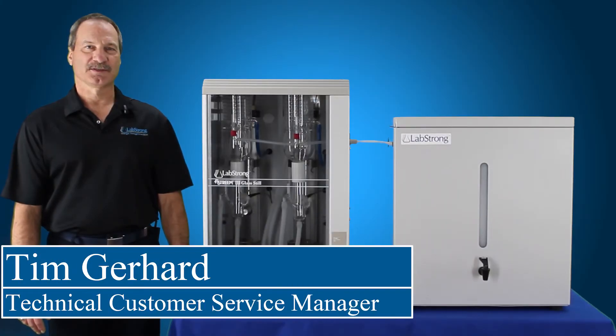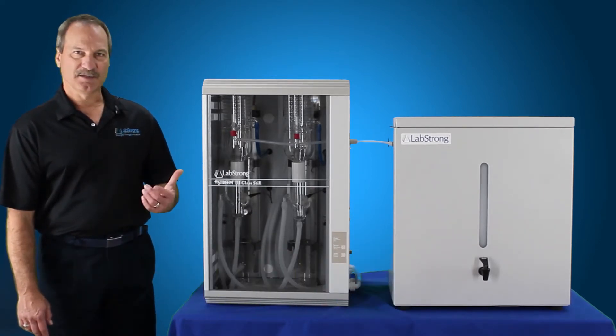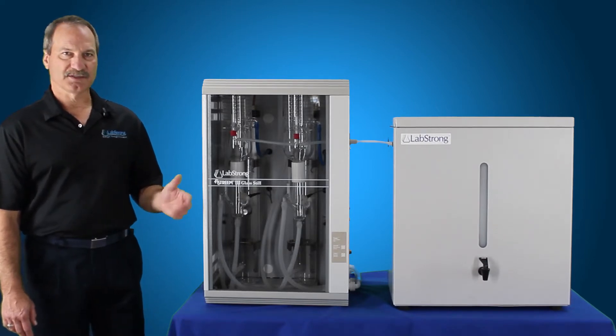Hello, my name is Tim Gerhardt and I'm from LabStrong. Today we're going to clean the FiStream 3 still. This is actually the 8 liter per hour system, but the 4 liter biodistiller and also the 4 liter system has the same cleaning setup.